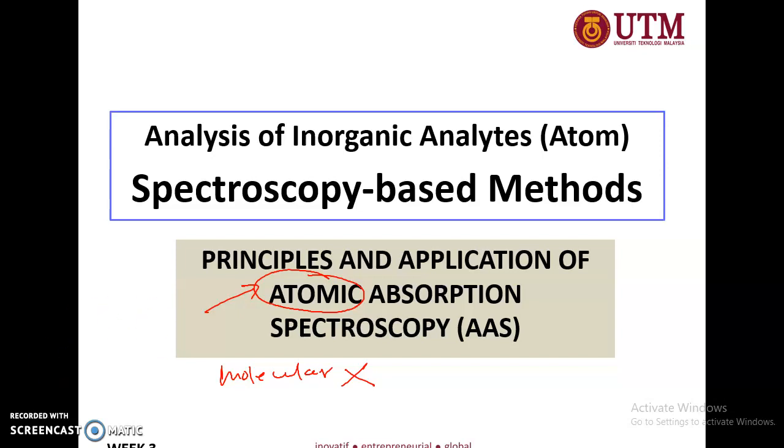When it needs high temperature, it means that this is not suitable for organic molecules anymore. Therefore, AAS is suitable for inorganic analytes. What are inorganic analytes? Inorganic analytes are those not comprising C, H, O, N, and S. Okay, let us see what will be available for analysis in AAS.